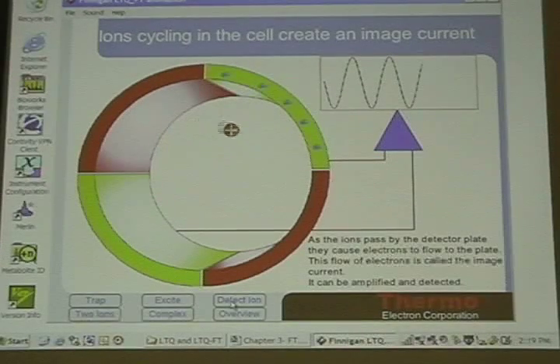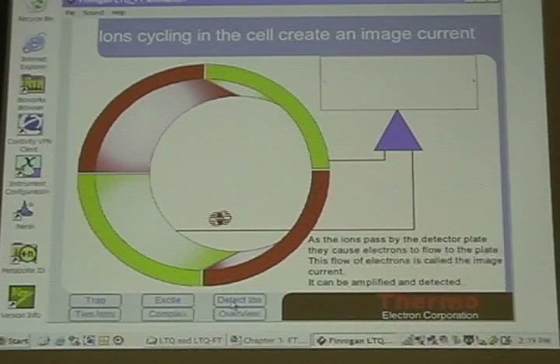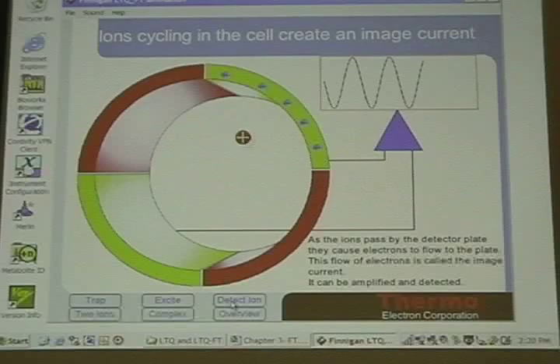Okay? Higher ion populations don't give you higher sensitivity. They give you higher dynamic range of co-eluting species. Higher sensitivity comes from ion optics, nanospray, and chromatography, and that's how we get higher sensitivity. Higher dynamic range we get because of using higher ion populations.